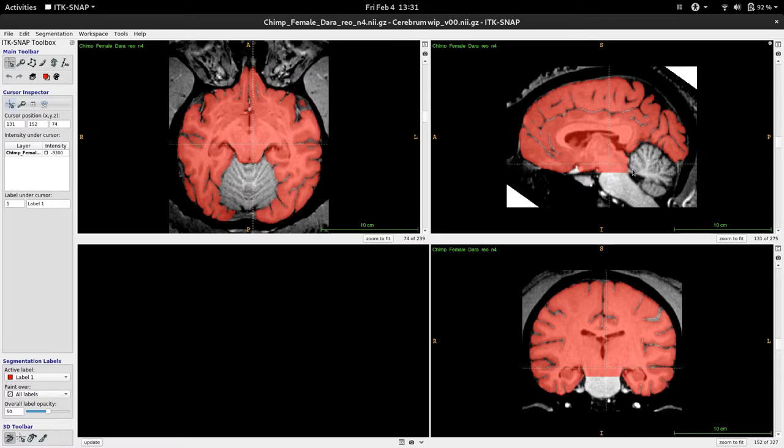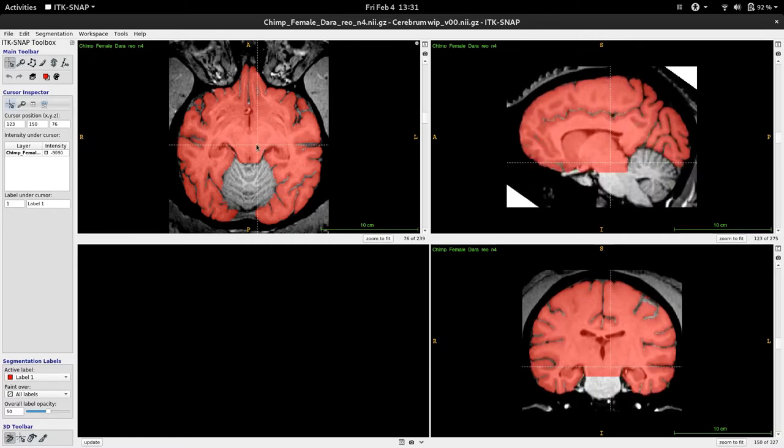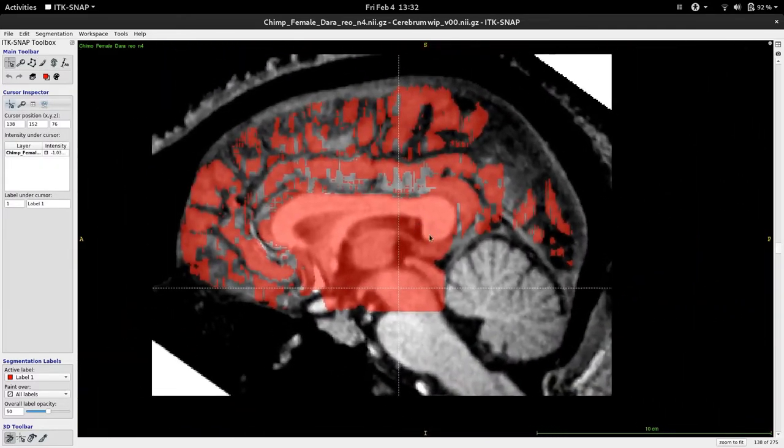Okay, to do it, first I usually look at the sagittal slices. I'm using a drawing tablet from Wacom to move around more easily than with a mouse. I look at this area, then I take my brush. It can be a bit larger, maybe as large as this. Then I will focus on sagittal slices.